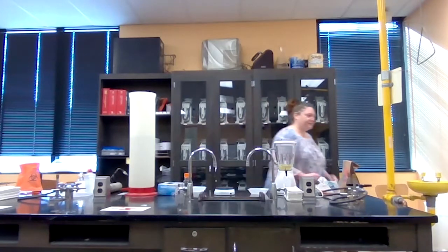All right. So now we need to grind this thing until it's liquefied, and we need to do that for about 5 minutes to get it in that state. So you do not want to listen to this run for 5 minutes. So we're going to take a brief little pause, and we'll be back in just a moment.